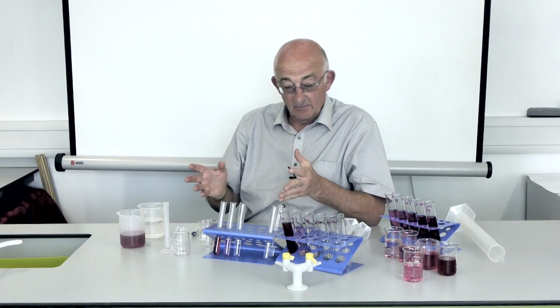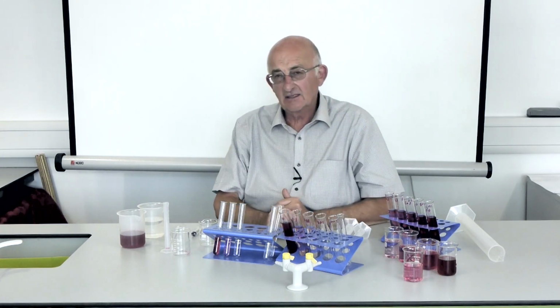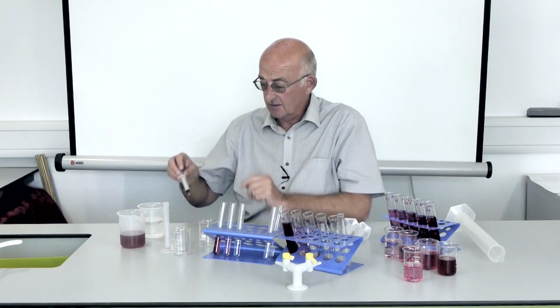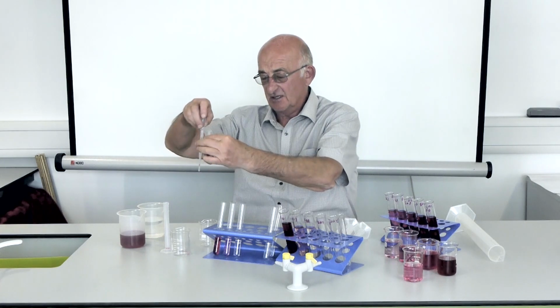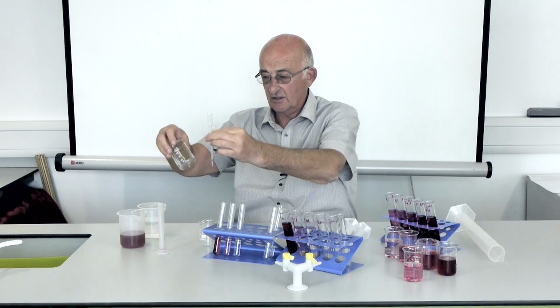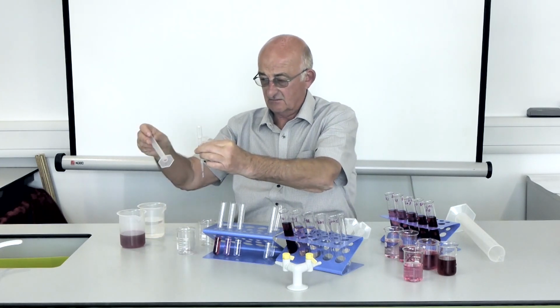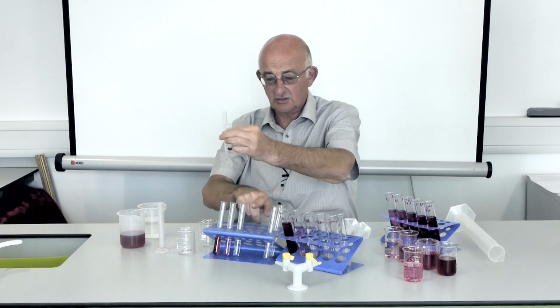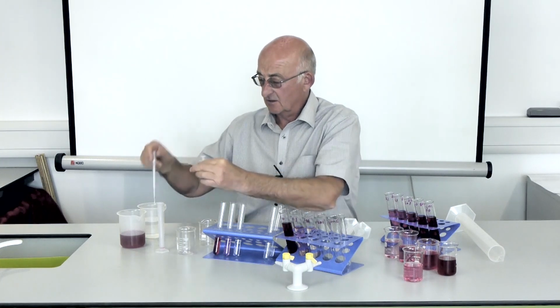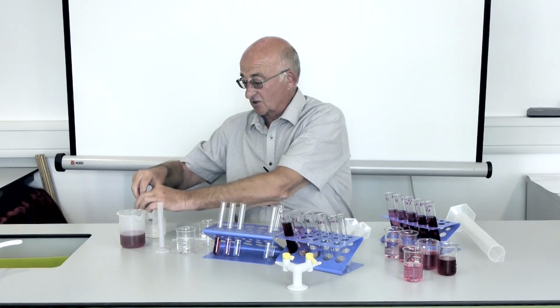However your students have devised a way of making this dilution factor work, they need to be aware of the potential contamination of all the little dribbles that are knocking around, and if this particular dribble went into one of those solutions further down the line, it's going to make an awful big difference. So good practice is washing things out all the way through.